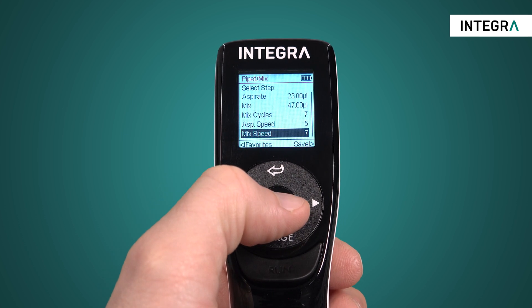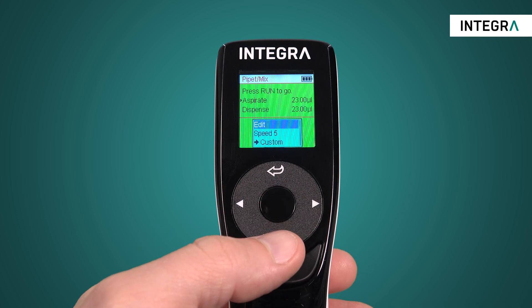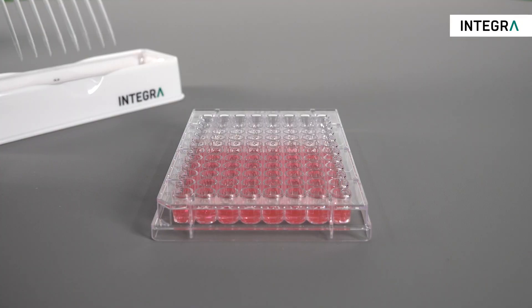Once the parameters are set, return to the run screen and you're ready to begin. Just like with all other programs, the black highlighted step indicates exactly what will happen when you press the run button on the pipette.